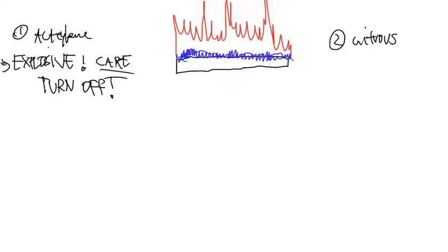What happens is that this tank could be sitting over to the side of the machine. And this tank has a line that basically will come from the tank into the back of the instrument. And that line is filled with acetylene.